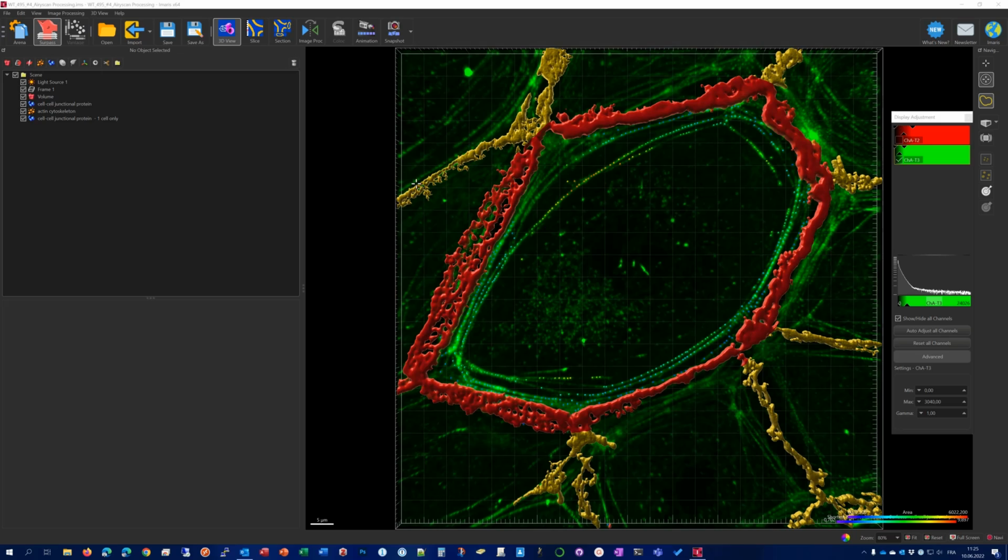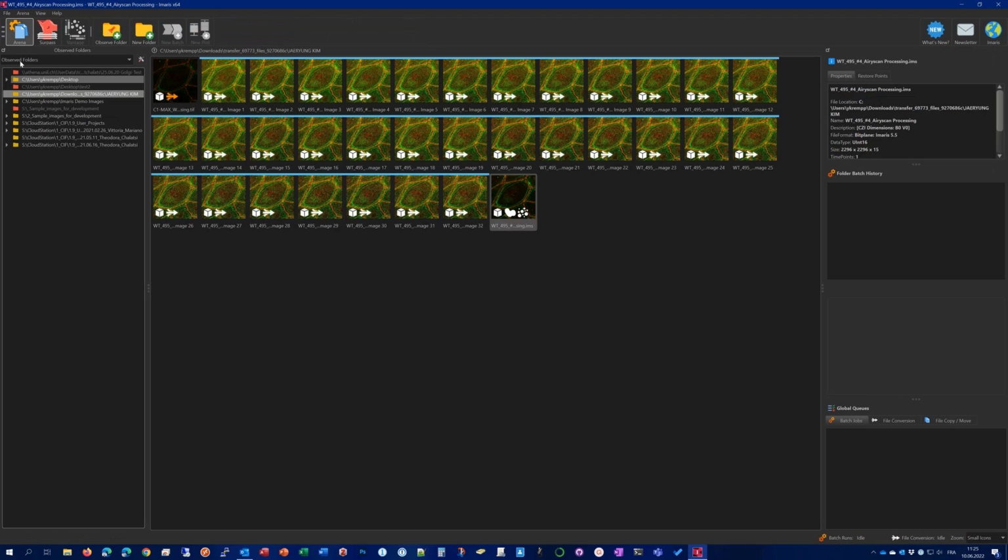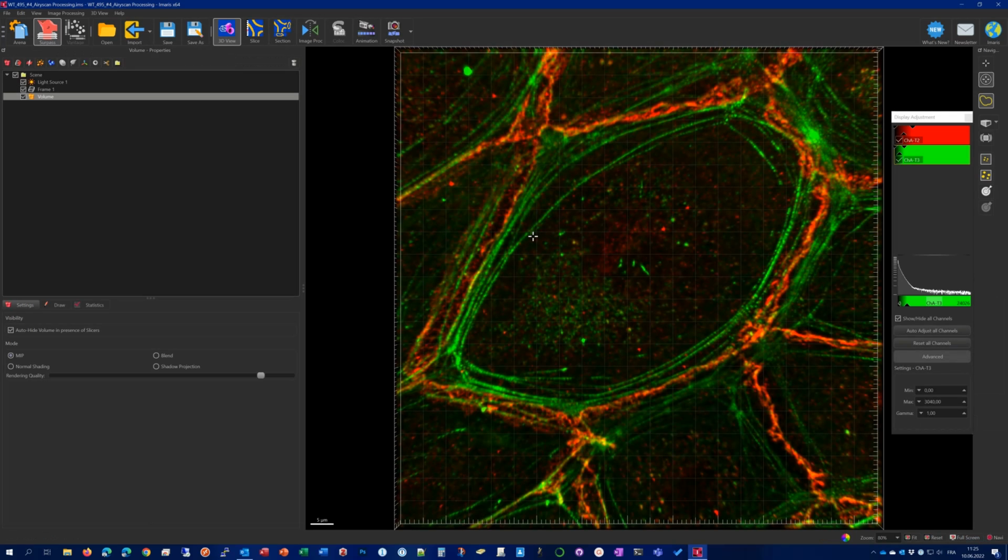Without further ado, let's revert to the original image here. So I can go to this by just right-clicking and open image only here. So this is a nice trick if you want to keep what you've done but just start over to see if another method is more suitable.